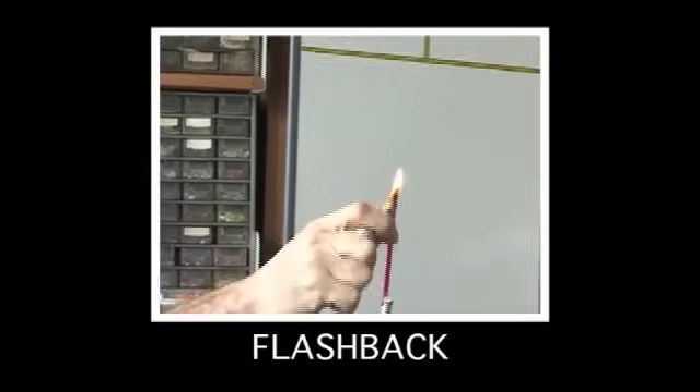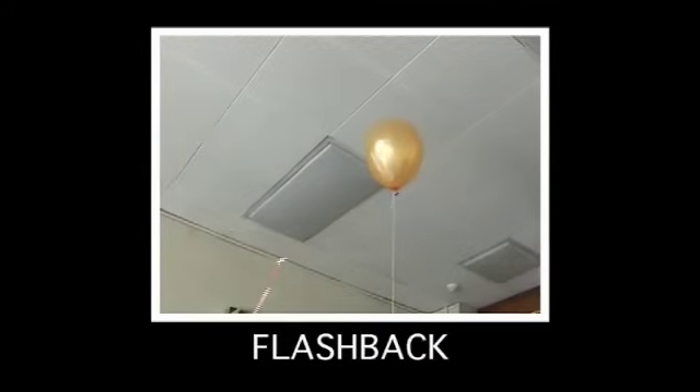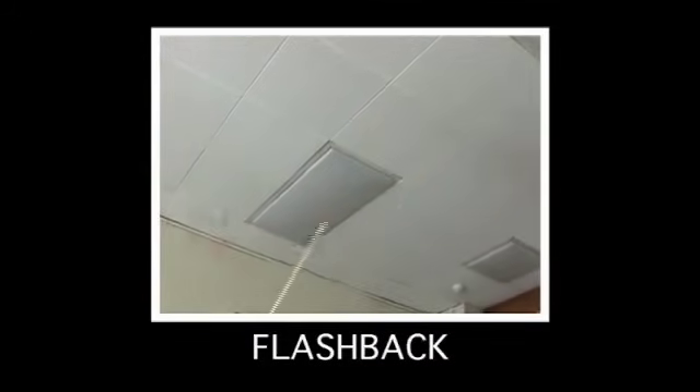We're braving the elements to repeat the experiment we did quite some time ago. You'll remember we had a very small balloon of hydrogen — match on a stick to hydrogen, big bang. And the fact that we've come outside might actually give you an idea about what we're going to do, because we're going to make it a little bit bigger. So let's go and fill a balloon.